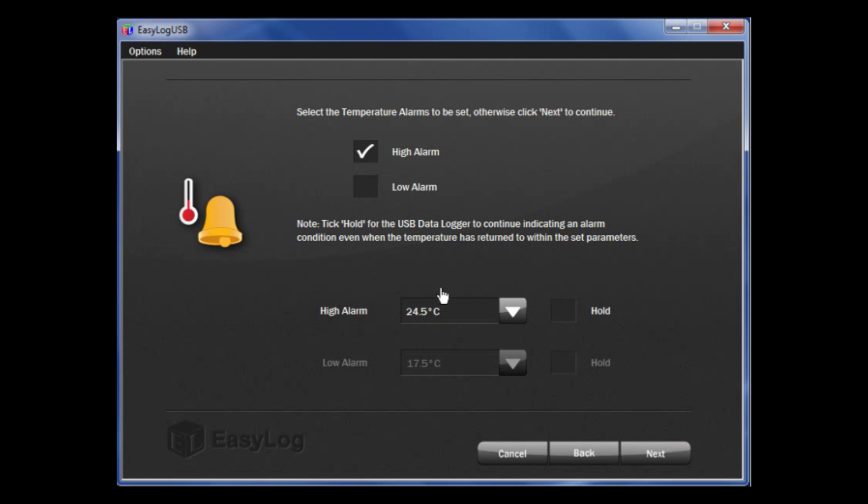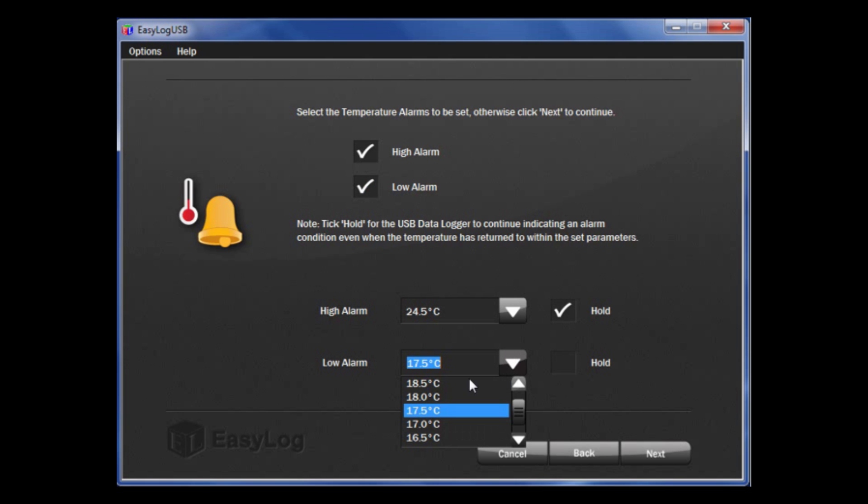You will note to the right hand side that there is a tick box saying Hold. This is a feature that will continue to show an alarm condition even if the temperature has returned to a normal condition. I will do the same for the low alarm and select the appropriate temperatures. Then select Hold for both of them.